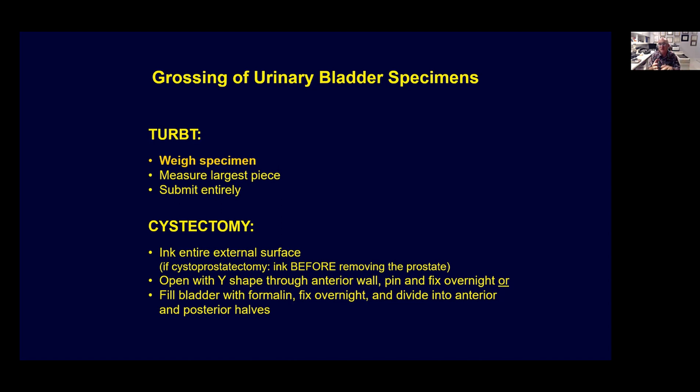like invasion, the papillary transformation, and involvement of the muscularis propria, then you have all the elements that are necessary for the evaluation of the specimen, and you don't need to submit more samples. So always consider that.